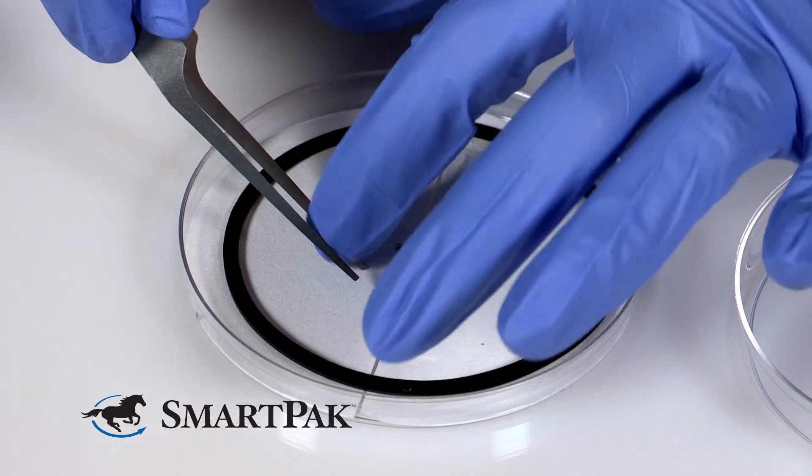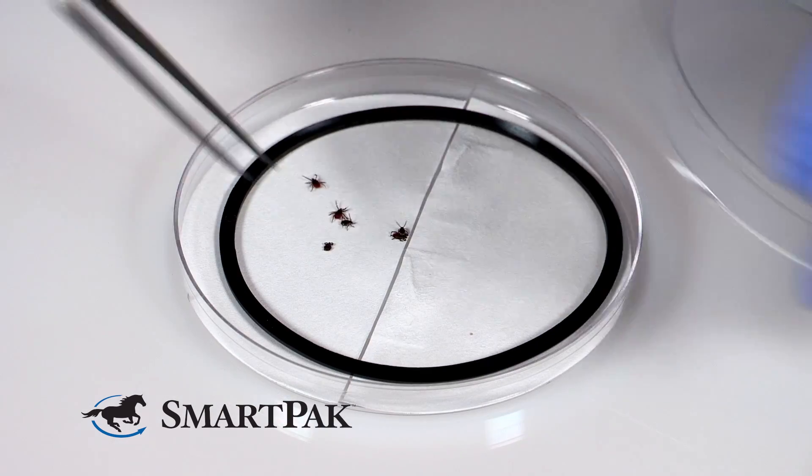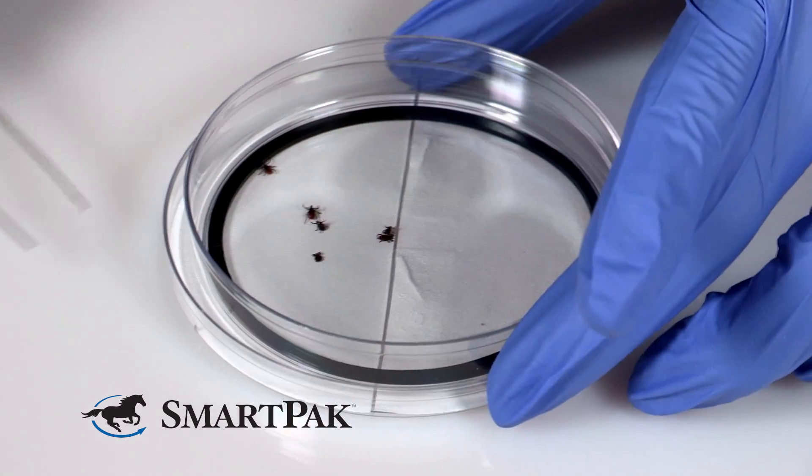For the tick petri dish testing, we take a filter paper and cut it in half. One side is untreated and the other side is treated with the Outsmart product. Ticks are introduced into the untreated section first and allowed to spatially distribute over time.